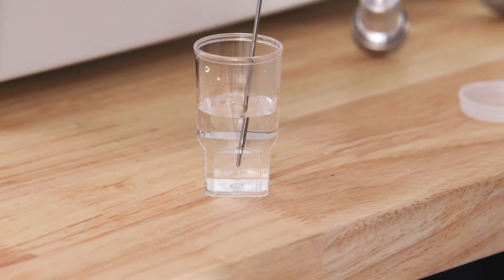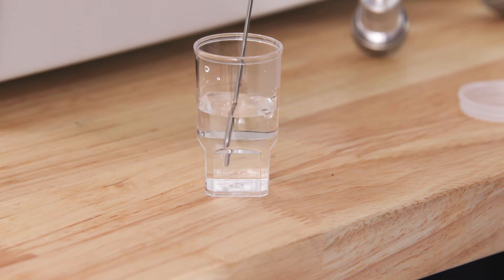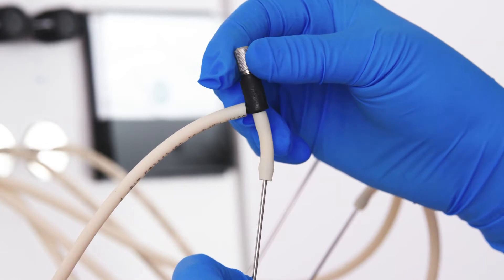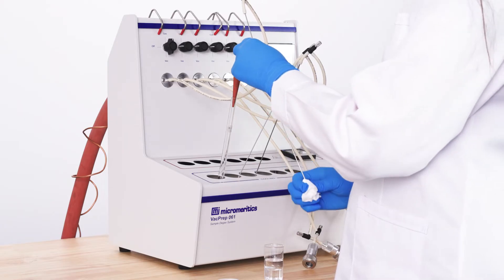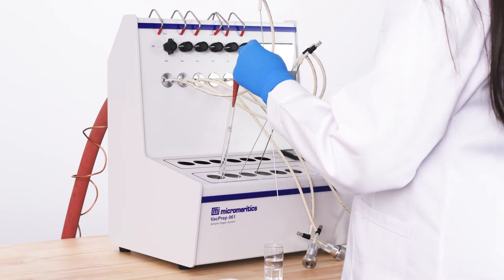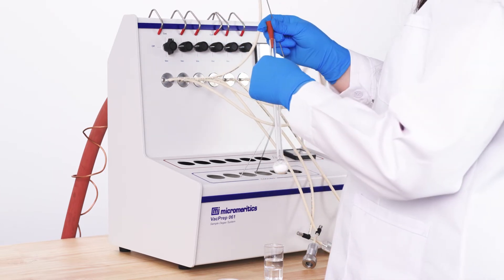Then submerge the tip of the gas delivery tube into water to check the flow of gas. Bubbles should rise from the tube indicating that gas is flowing. Turn the knob at the top of the tube to adjust the flow. Wipe the tip of the tube clean and insert it into the sample tube.